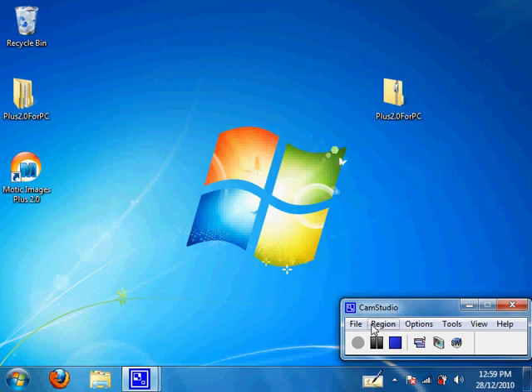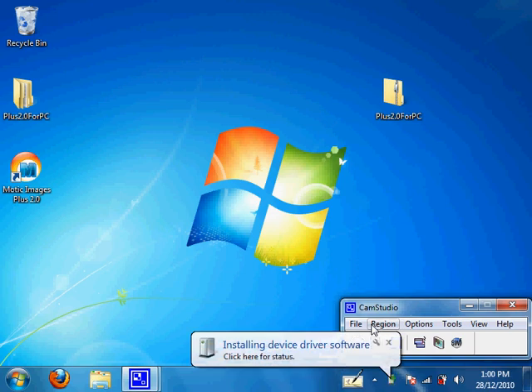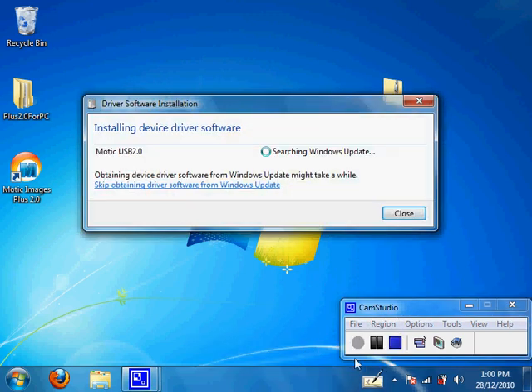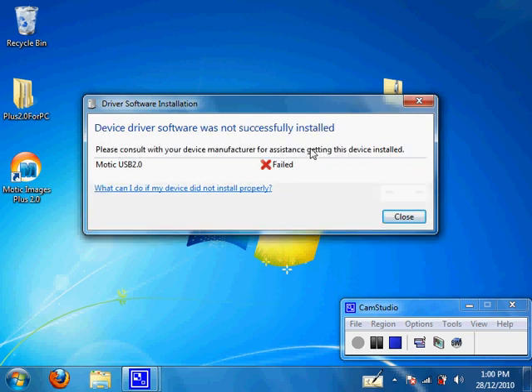Now I will try to plug in the USB cable. Windows should automatically detect my software on my camera and try to install it. I will click on the pop-up button here. It should fail as it does. So what I need to do is close this window.